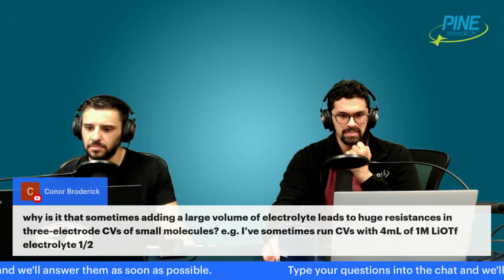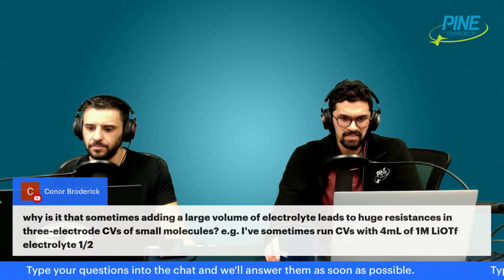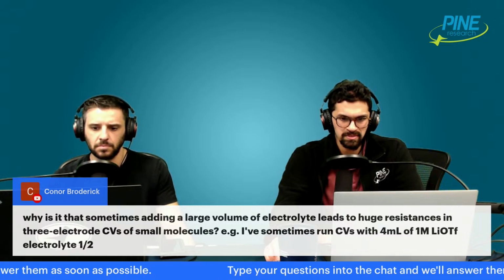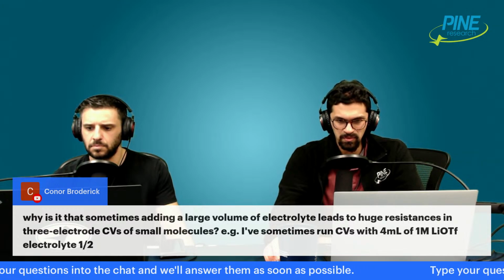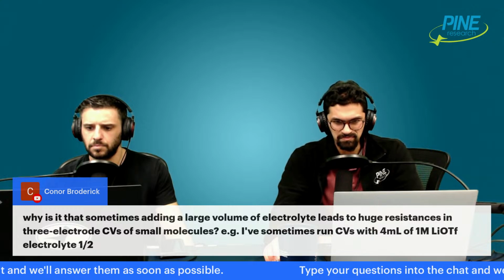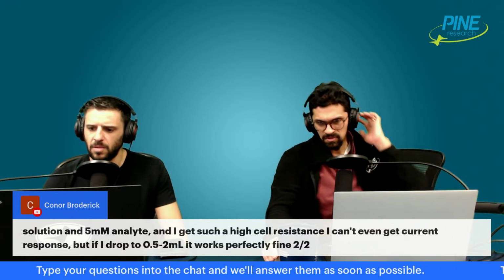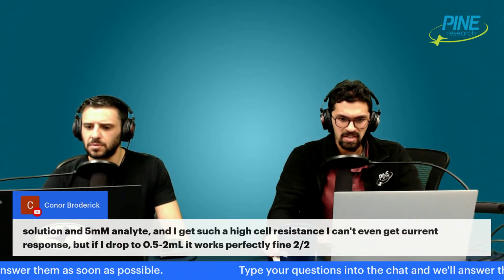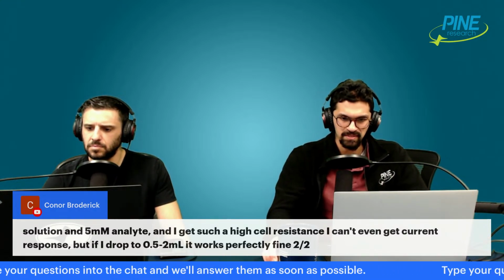The next question comes from Connor Broderick. Connor asks, why is it that sometimes adding a large volume of electrolyte leads to huge resistances in 3 electrode CVs of small molecules? For example, I've sometimes run CVs in 4 milliliters of 1 molar lithium OTF electrolyte solution with 5 millimolar analyte, and I get such a high resistance you can't even get a current response. But if you drop the volume to 0.5 to 2 milliliters, it works perfectly fine.